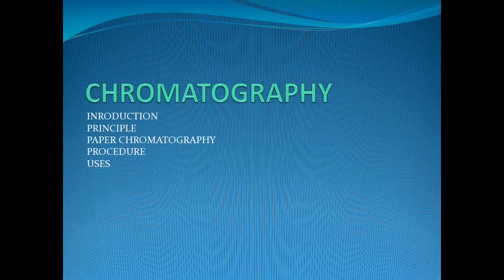Good morning, students. Today we will discuss another activity for the separation of different constituents of a mixture. This technique is named chromatography.